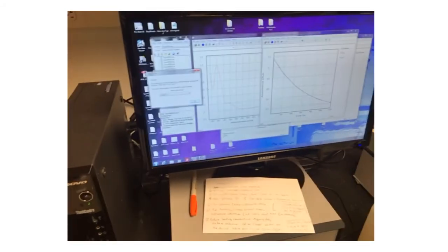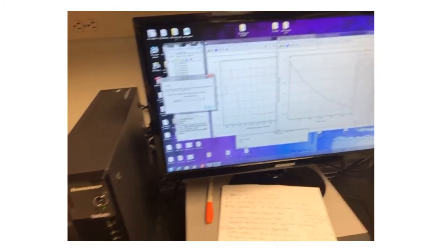Okay, so I think that's the basic run through for data analysis and data extraction.